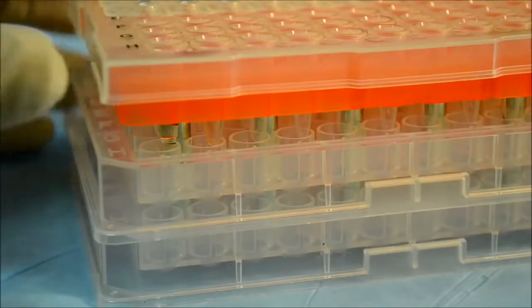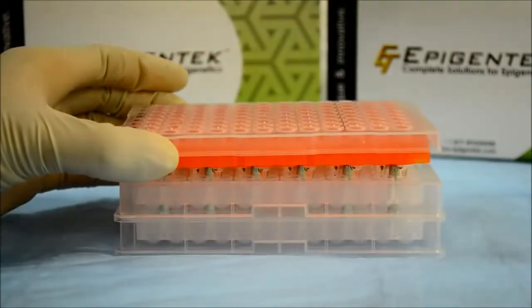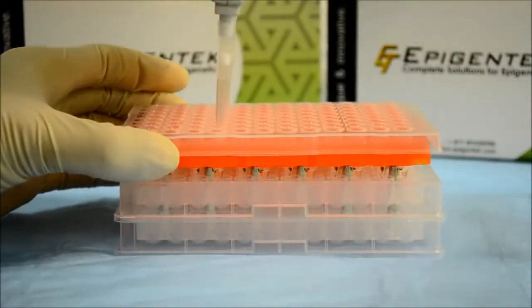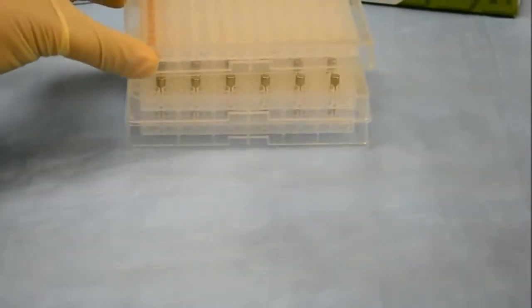Next, gently slide the adapter to the left and repeat the process. But this time, pipette the even rows. No more transferring from PCR plates to microplates, and no need to purchase different magnetic stands. Simple and powerful at an attractive price.